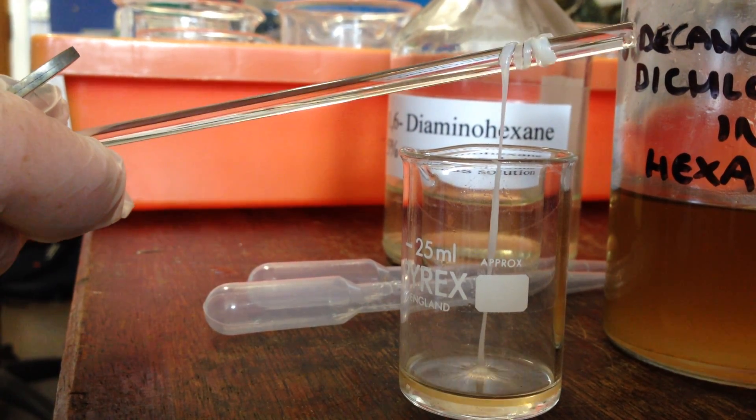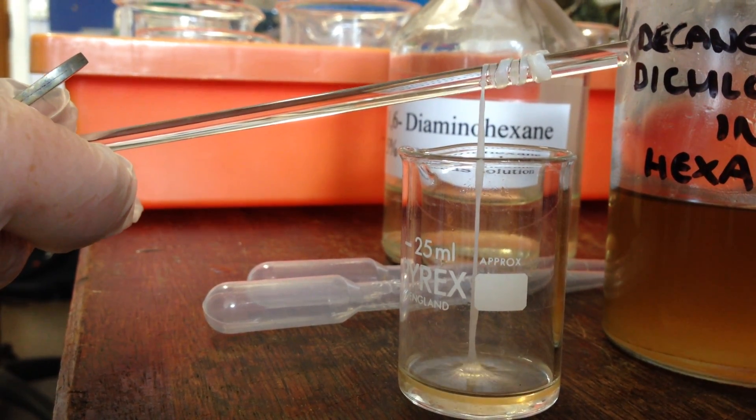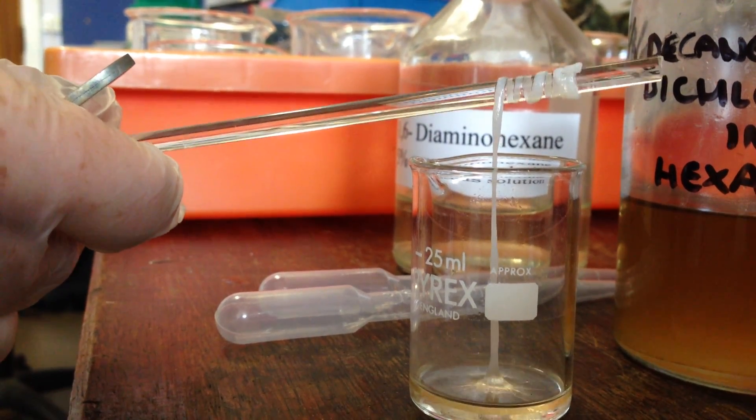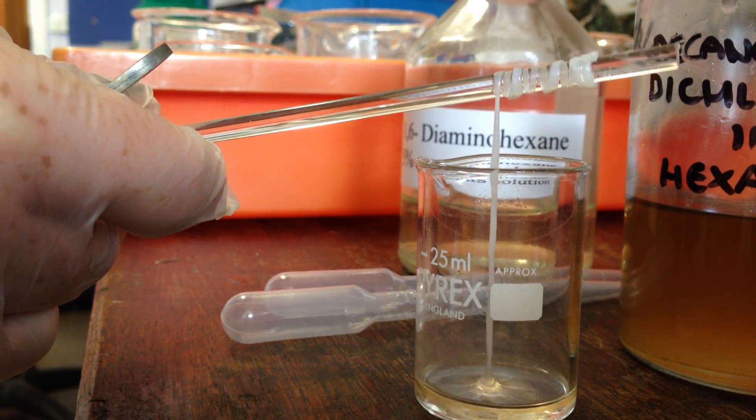Every time I take this out, more of the two monomers which are layered on top of each other come in contact. When they come in contact, they polymerize, and then I can pull them out as nylon.